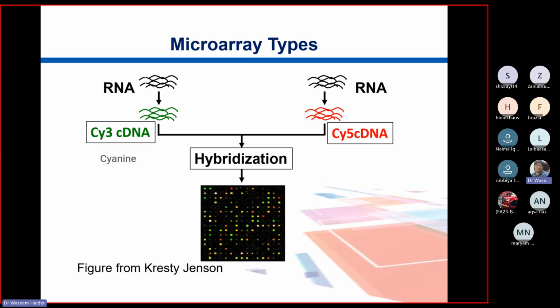So this goes with, there are 4 nucleotides, so we get 4 as a base, and then raised to the power of the word size. So here the length which you are defining is a word, 10 or 20 or 30 or 40. So it goes like 4 raised to power 10. So there are 4 raised to power 10 different combinations, and amongst them, this combination with which this probe is made is just one. So it is 1 out of 4 raised to power 10 or 20.